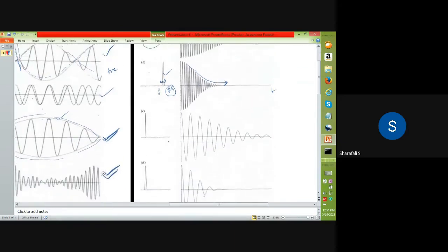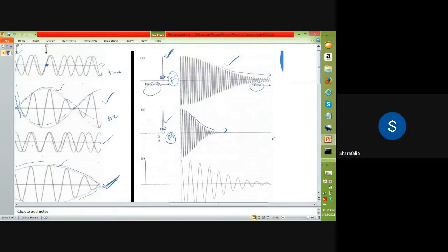Similarly, if you consider here also, we have changed this. Remember that these two have their frequency at the same position. You can see that both have the frequency at the same position, so their frequency is not changed. If you consider the separation between two adjacent signal parts, or a single cycle up to this point, measure that time period and take the inverse of it to get the frequency. That frequency is the same for both these cases.